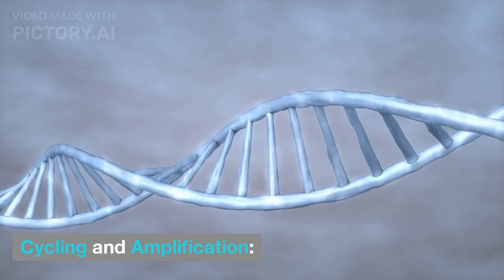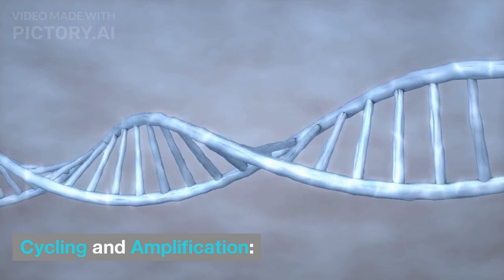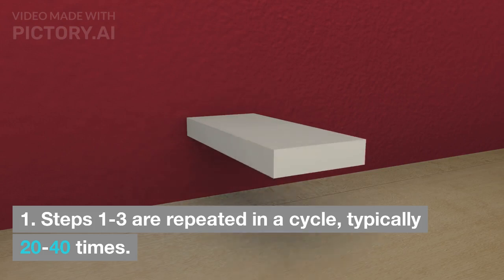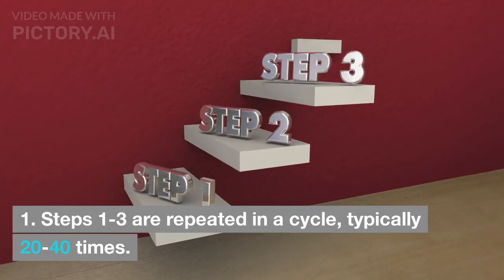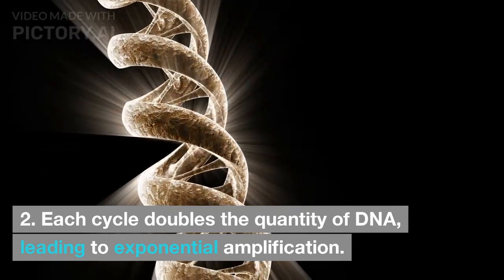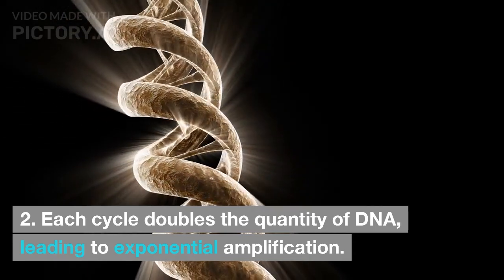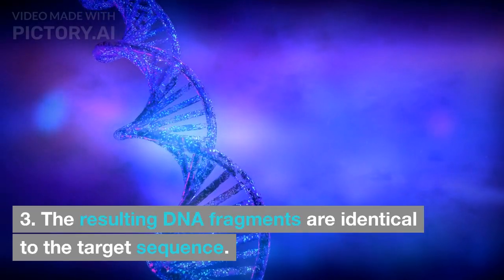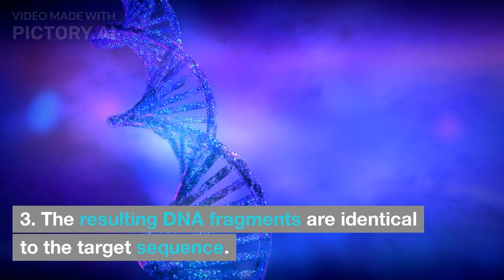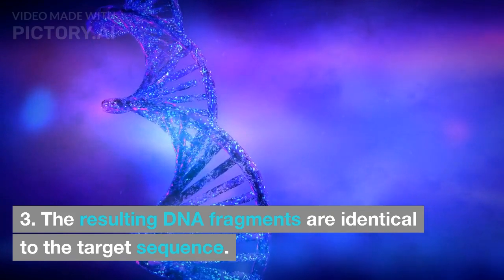Cycling and amplification. Steps 1–3 are repeated in a cycle, typically 20–40 times. Each cycle doubles the quantity of DNA, leading to exponential amplification. The resulting DNA fragments are identical to the target sequence.